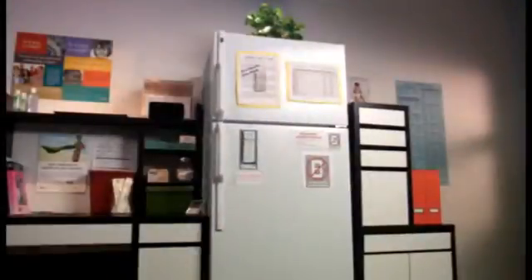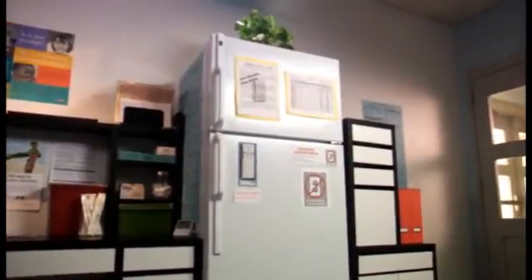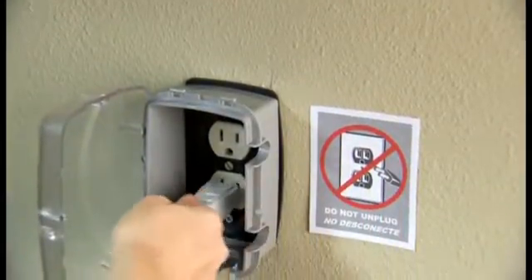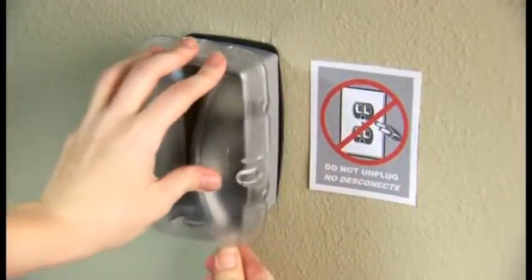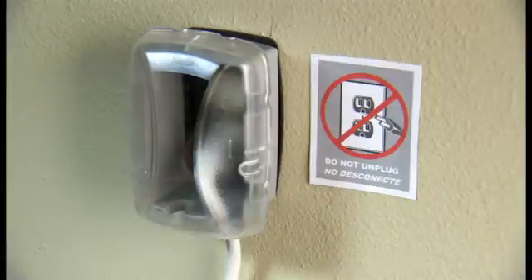Let's discuss the power to the unit. Your refrigerator should be in good working condition and must have power at all times. To avoid any disruption to the power, you should install a plug guard, similar to this one, over each outlet. This will prevent the plug from accidentally being pulled out from the wall socket. You should also post a sign at the wall plug warning others not to unplug the unit.